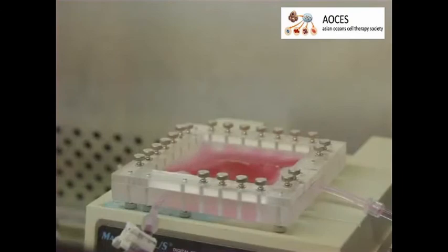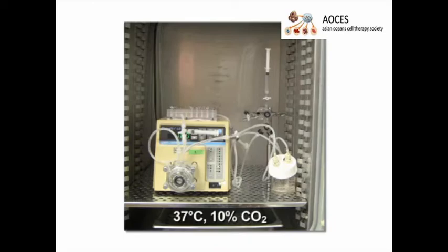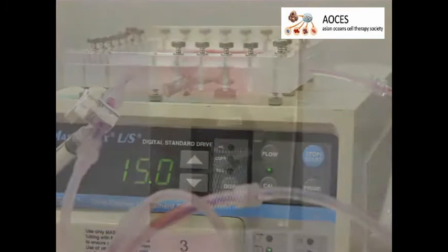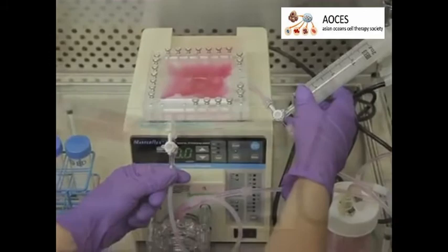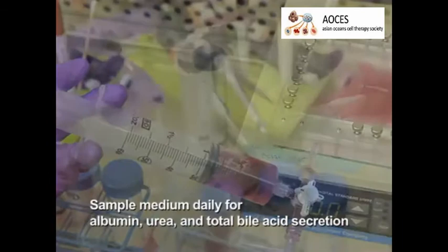Aseptically close the perfusion chamber and seal it tightly to avoid any leakage during the culturing. Incubate the perfusion system at 37 degrees Celsius with 10% carbon dioxide, and increase the perfusion flow rate to 15 milliliters per minute. Connect the oxygenator to a 95% oxygen and 5% carbon dioxide gas mixture tank and set the gas flow rate to 0.5 liters per minute. This should achieve an oxygen partial pressure of approximately 400 millimeters of mercury. Continue the culture for up to 10 days with daily changes of culture medium.